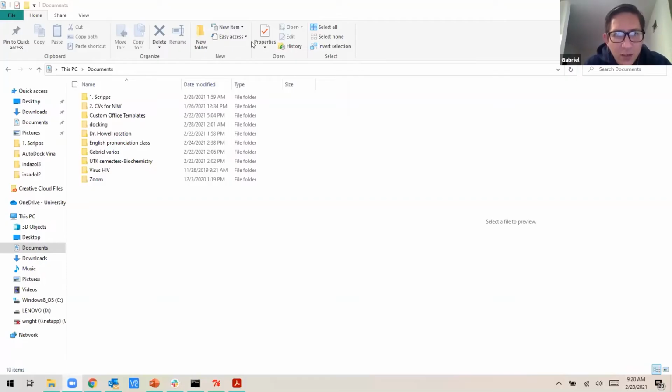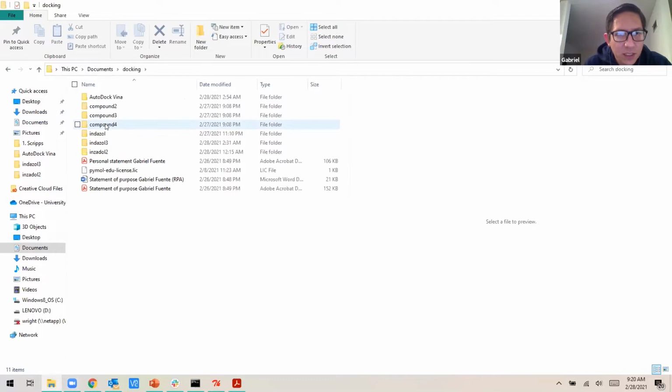So here, this is my computer. I have in my documents, wherever I'm working in the scripts, a folder that says docking. This is going to be my working directory.